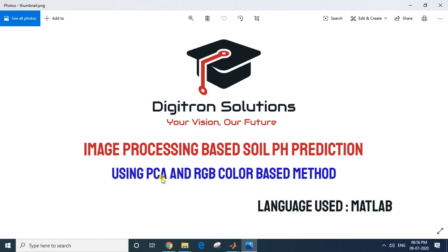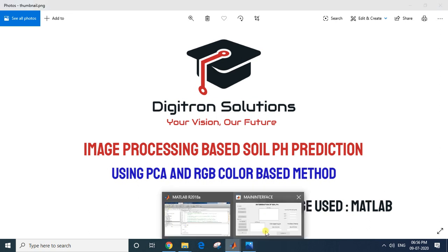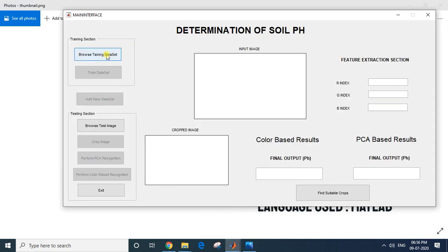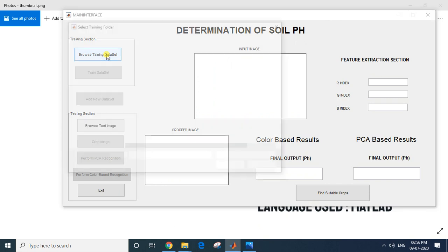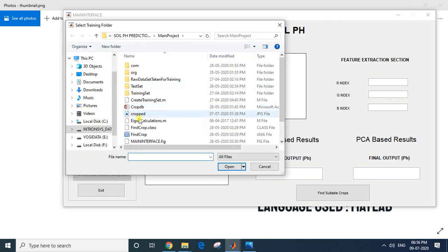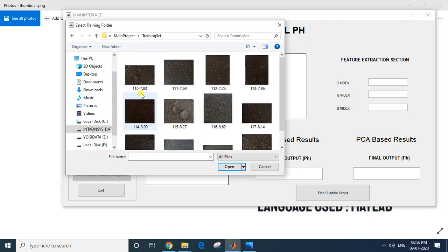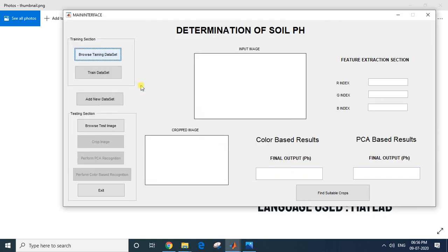The supervised learning method — PCA — is a method in which training is required. The color-based method is an unsupervised learning method where no training is required. So this training section is basically for our PCA method. I'll browse the training dataset and select the training data folder.